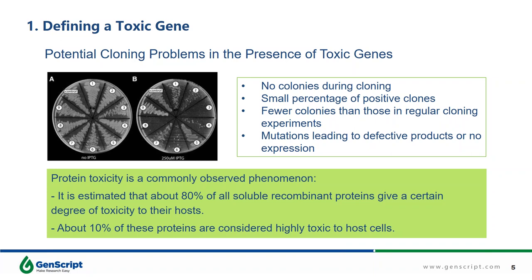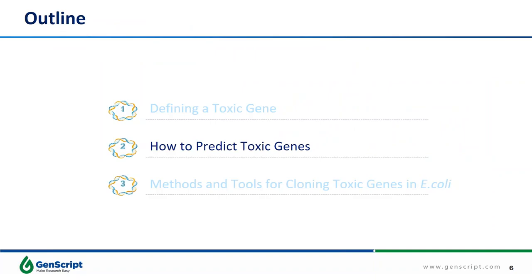There are several problems when subcloned DNA contains toxic genes. You can find fewer colonies than those in regular cloning experiments, and sometimes the target DNA fragment contains a mutation or some DNA parts are missing. A more severe problem is that there are no colonies at all in cloning experiments. Usually we attribute this to low efficiency of DNA assembly, but from now on, please also double-check if your DNA fragment contains toxic genes. You may ask: how would I know if my gene of interest is a toxic gene? In the next part, we will answer this question.